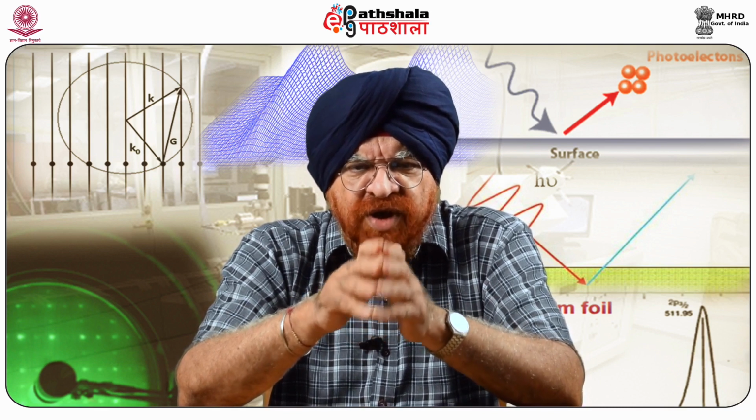Conductive atomic force microscopy is a powerful tool, first developed in 1993 to study the local tunneling currents through 12 nanometer thick silicon dioxide films.